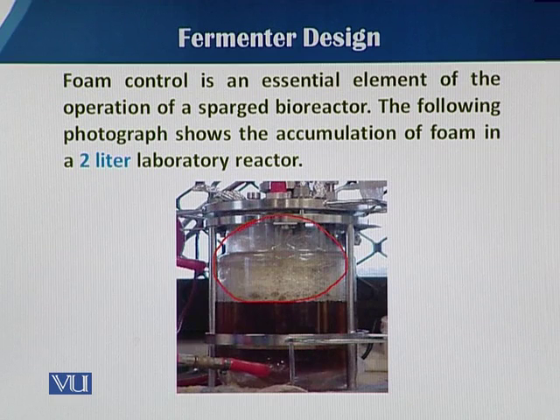When foam is produced, it can affect the oxygen solubility, for one. Second, the existence of the foam also makes a column, and then there is a loss of the fermentation medium through the exit air point.